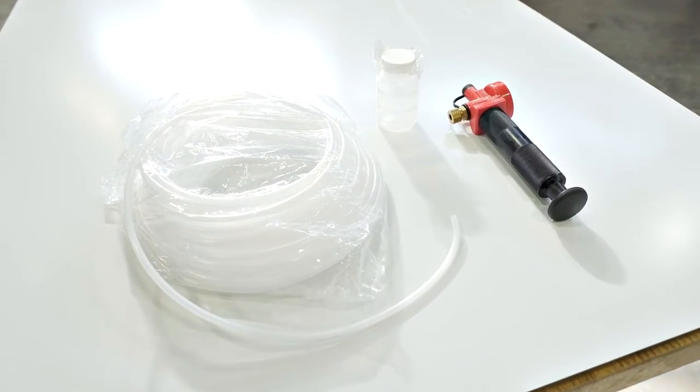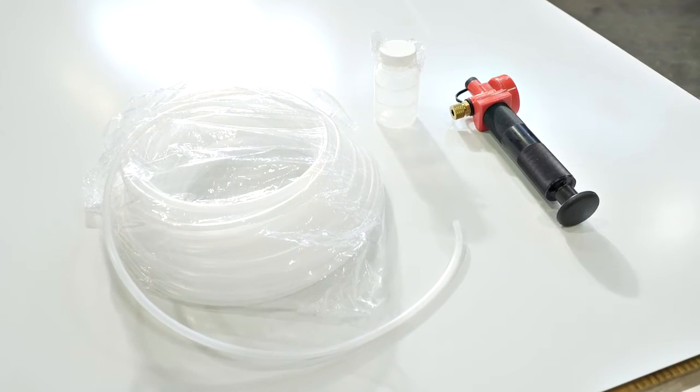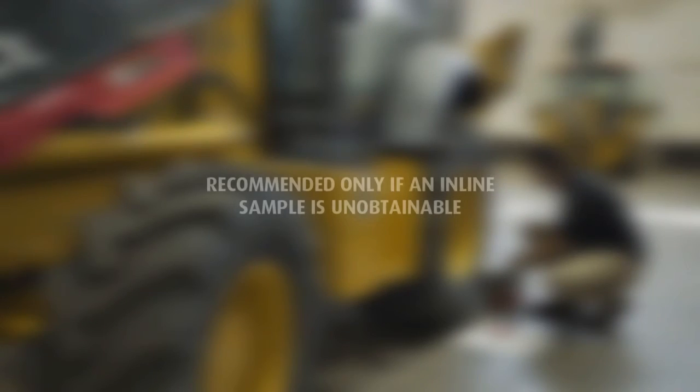Another method is pulling a sample from a reservoir or sump using the vacuum pump with tubing. Obtaining a sample from the reservoir is recommended only if an inline sample is unobtainable. The fluid to be sampled should be warm and circulated for 30 minutes in order to obtain a representative sample. Fluid and equipment that has not been operating and is cold allows information such as wear metals and contaminants to settle out in the reservoir.